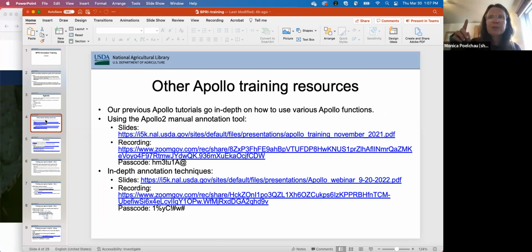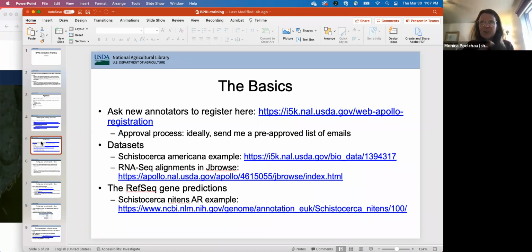So just to refer to some of the other training resources that exist for the Apollo basics, and I sent you those in the email that I had previously, I think. Okay, so very much basic.